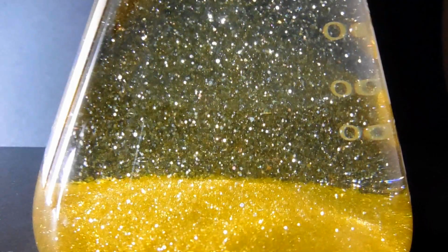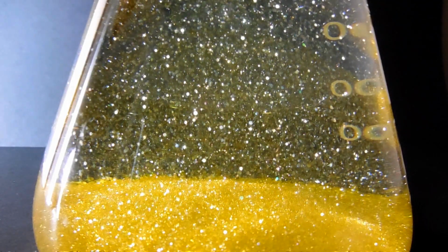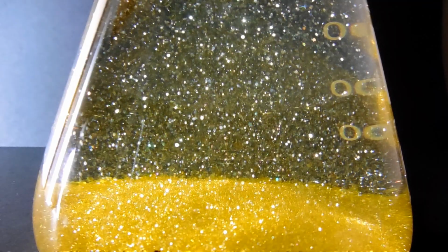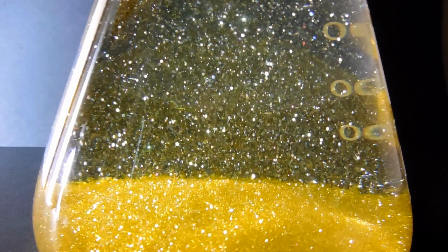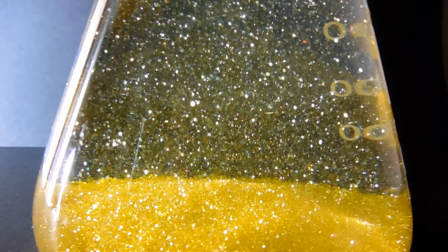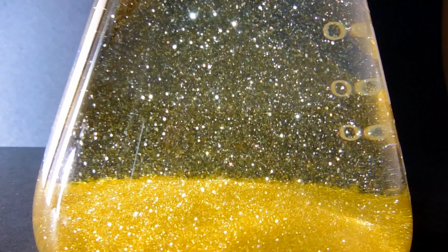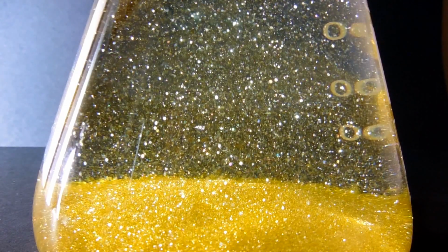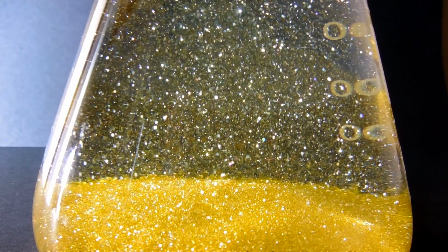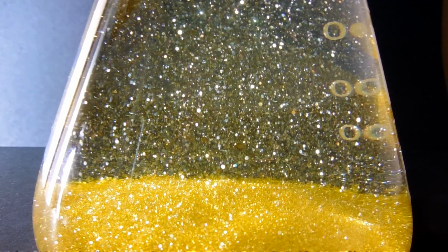Would you believe 4 hours later, this solution still has suspended gold lead iodide? Amazing. I can't believe how long this has lasted, and it's just been absolutely gorgeous the entire time. Now, solubility below room temperature is even lower, so I think what I'm going to do is take this and put it in the fridge for a while and see if we can't get some more of these crystals to come out.